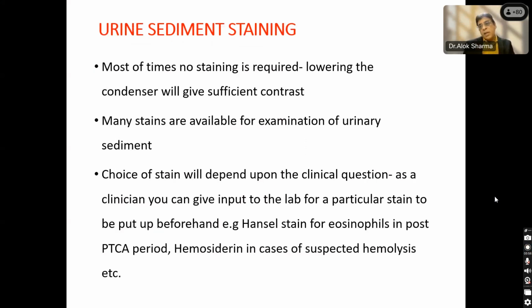Now, coming to the staining or the visualization part, I just told you that most of the time you will not require any staining, and just lowering the condenser on a fresh slide would give you a lot of information. However, there are several stains available which you can use on the urinary sediment, and the stain you choose would depend on the clinical condition in question, right? You can't put so many stains over every specimen.